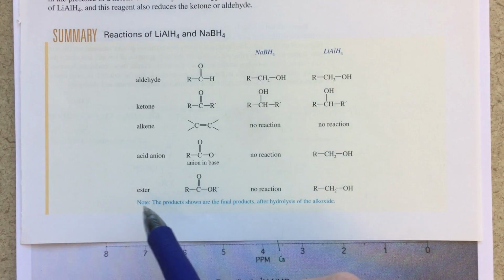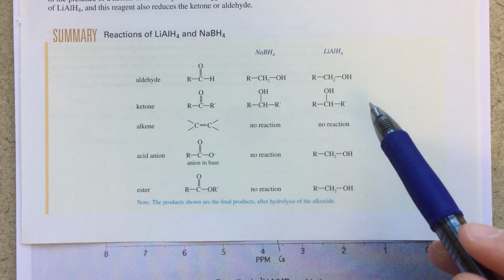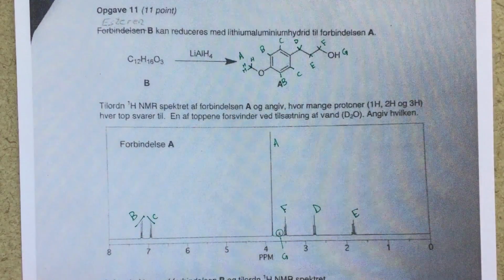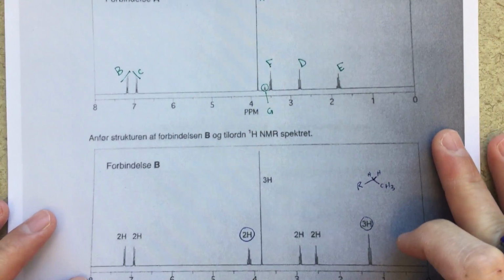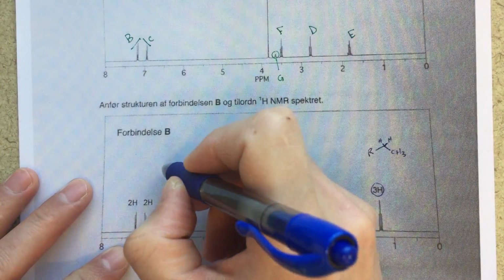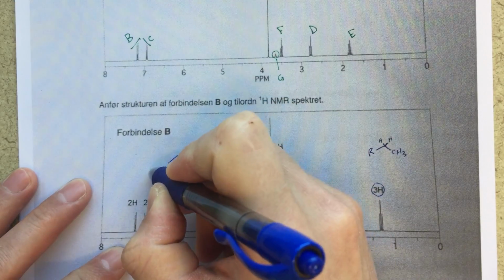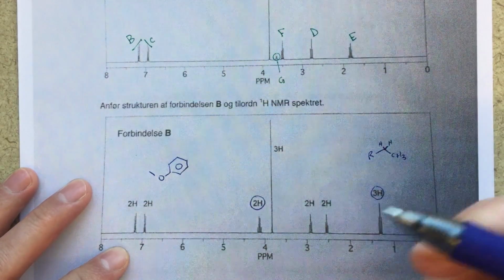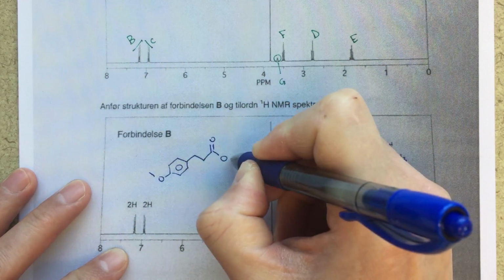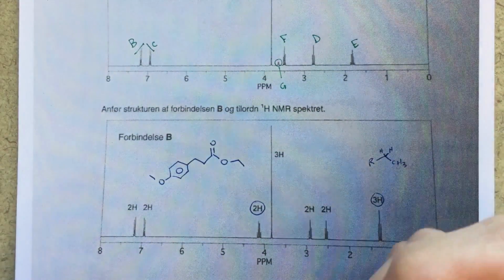So when I looked through this list, what are the different reactions that might fit nicely? That ester is the one that really jumps out at me. So looking at that, the way that I would go about this, I would start by saying, well, let's just make a guess. And I think that this is really the hardest part of doing problems like this, making a guess and then going for it and seeing where that leads you. Because it's hard to make guesses.